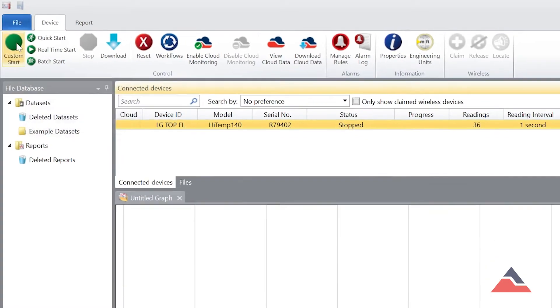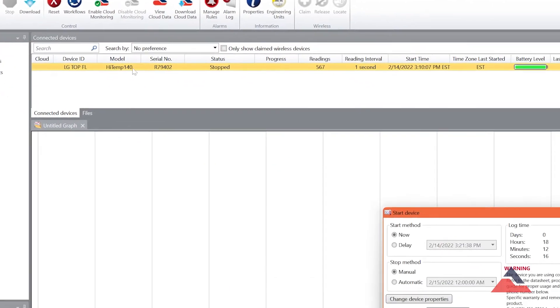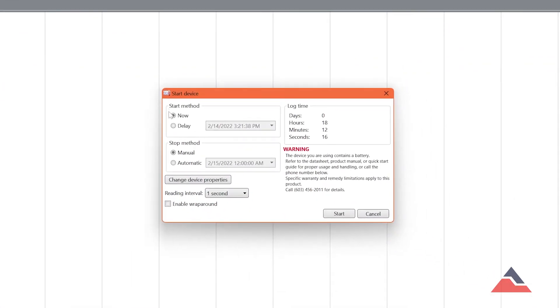While in Custom Start, you'll select the desired start method, reading rate, and if desired, an automatic stop time to end the recording.